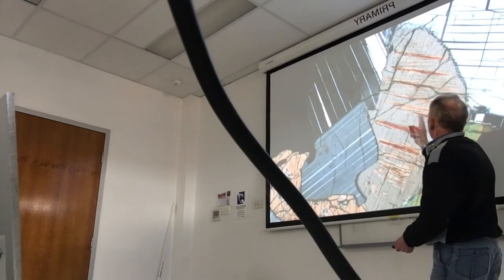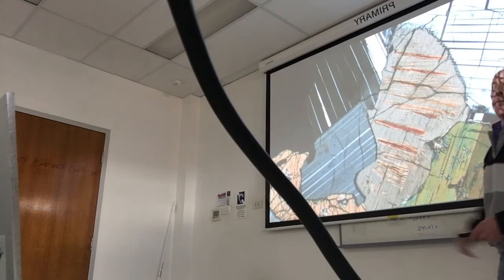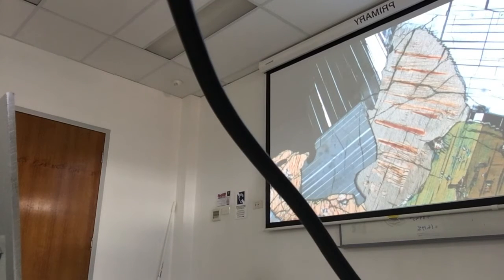That'll be Z, gamma's out here somewhere, so they're apparently parallel. We went through that before when we did pyroxene. So remember, clinopyroxenes can show you straight extinction. If you're looking into the optic axial plane, they will show you straight extinction, and they'll be the same grains that have lower birefringence. It's only the higher birefringence grains of clino that show you obvious inclined extinction.